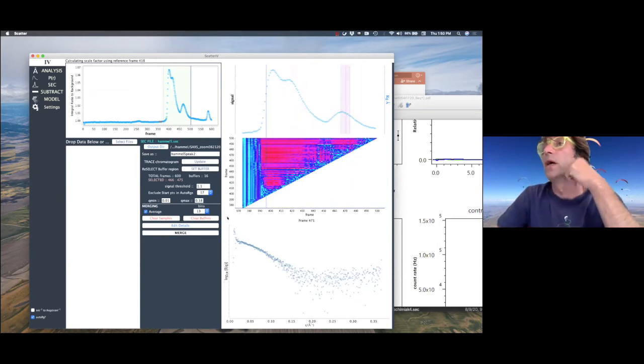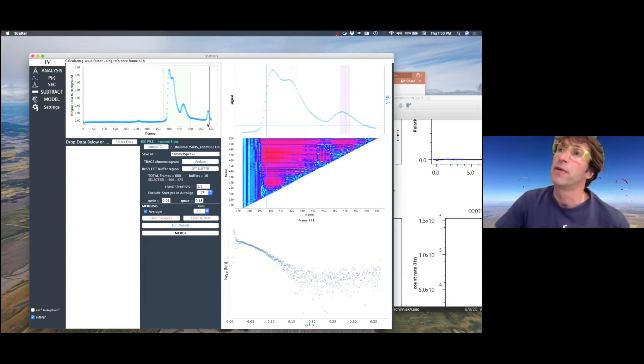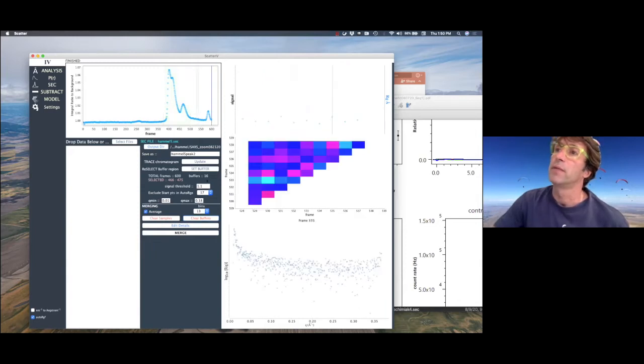How to deal with it? Again, if you want to redo your buffer subtraction and merging from what you already have from us, you just clear the buffer, select the buffer in the back, and update it. For this peak, the closest buffer is not the one before but the one after the capillary fouling. That's the easiest way to deal with this problem.